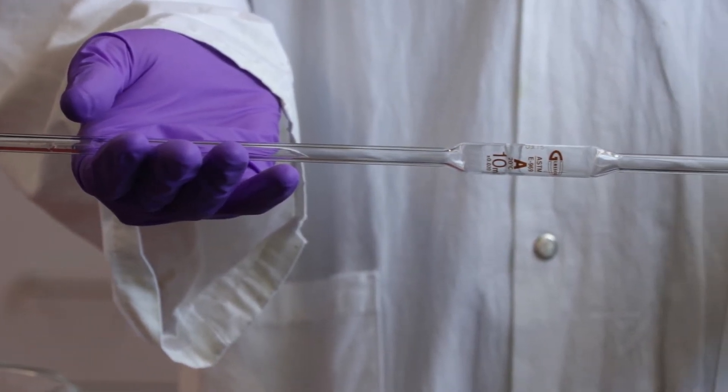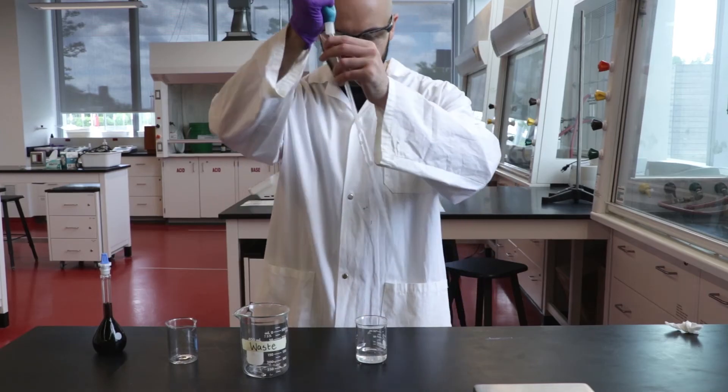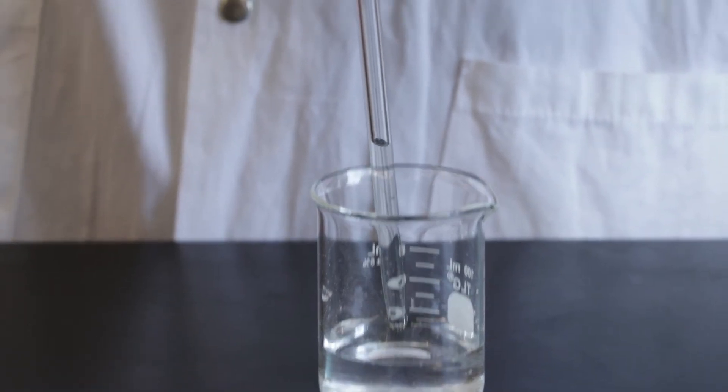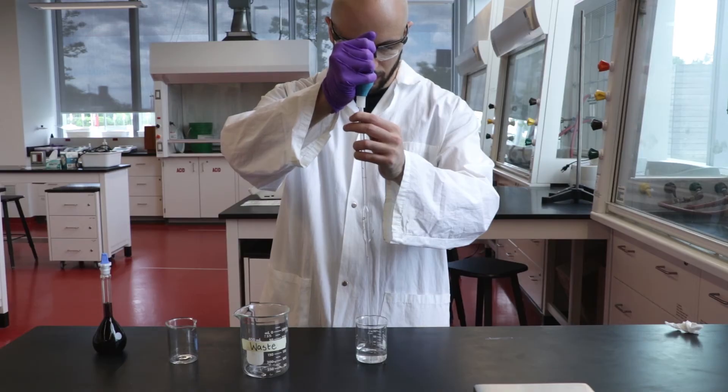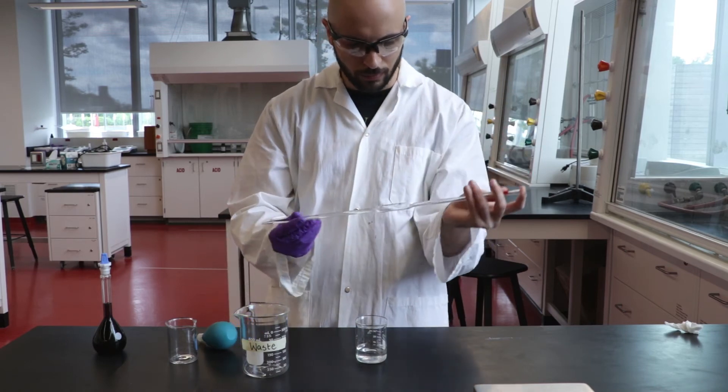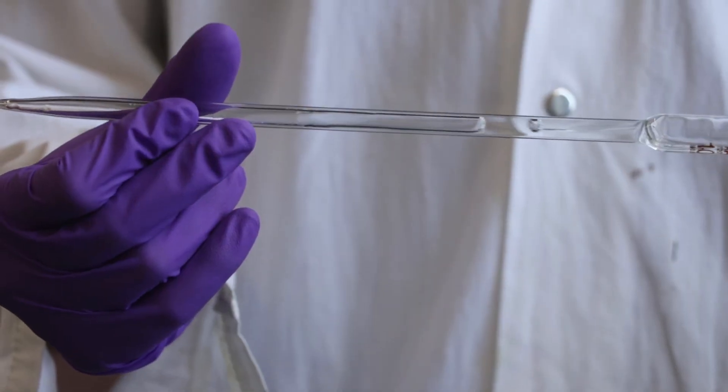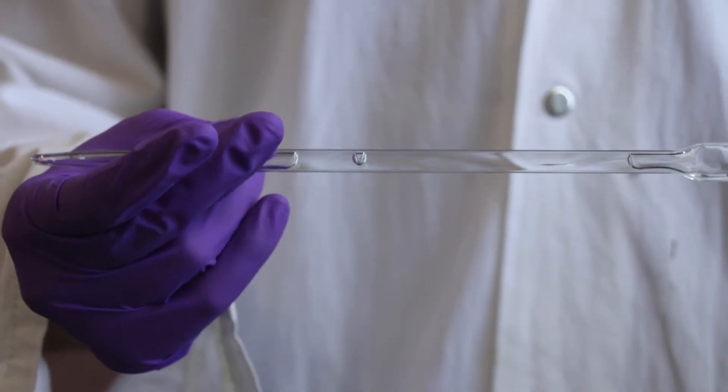Volumetric pipettes must be cleaned before use to ensure accurate volumes are delivered. First rinse the pipette three times with distilled water. Draw up a small volume of water until it just reaches the wide section of the pipette. Rinse the inner surface of the pipette by swirling the distilled water back and forth throughout the pipette and then discard the solution.